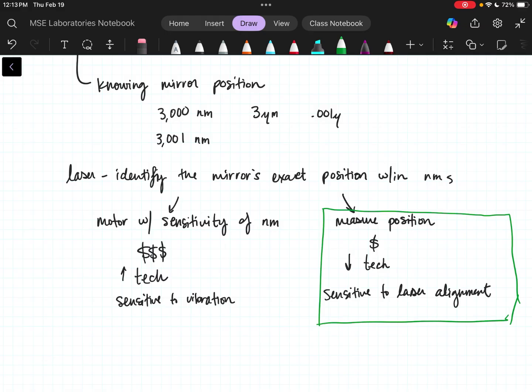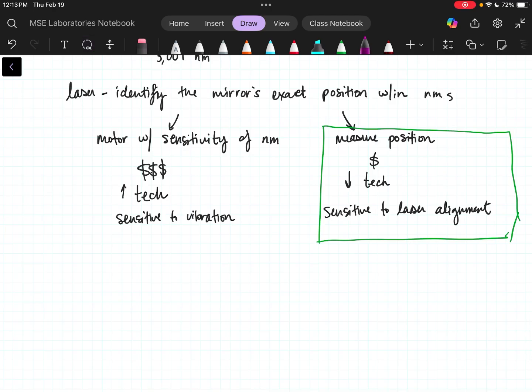So this is absolutely sort of our gold standard here. There is no point in doing something that is expensive and harder to do. We choose cheaper and easier pretty much always. It's almost the same results. It is better results because the sensitivity on this was sensitive to vibration. You're gonna get really crappy data if your motor comes off just a little bit. Your detector's not gonna have any idea what wavelengths it's looking at.